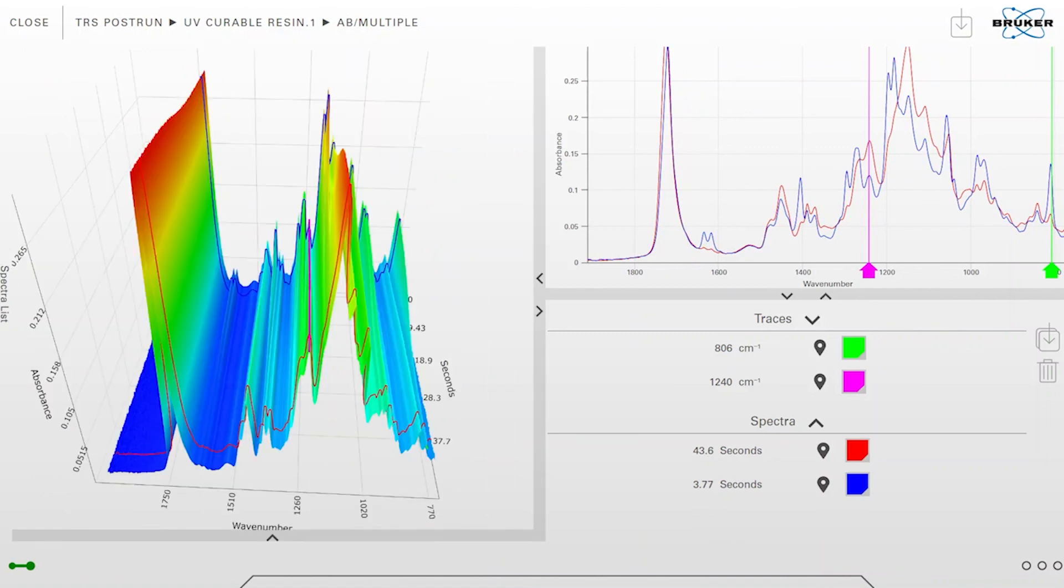As you can see, you have a bunch of possibilities to visualize and process your data here. I hope you could learn something about this 3D view. Watch also one of our other videos.